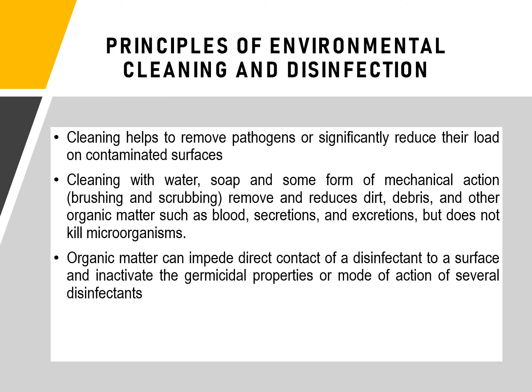Organic matter can impede direct contact of your disinfectant to a surface and inactivate the germicidal properties or mode of action of several disinfectants. In the previous slides, we have mentioned that some disinfectants are actually inactivated in the presence of organic material. So before we apply these disinfectants, we have to remove first the organic materials.